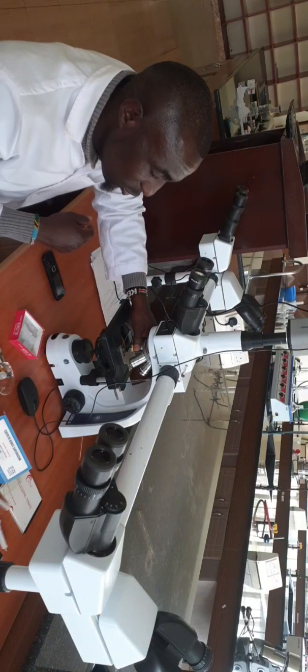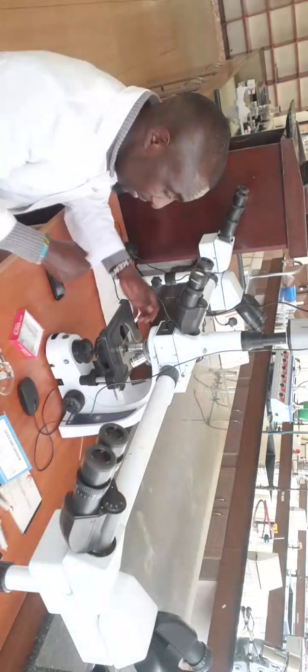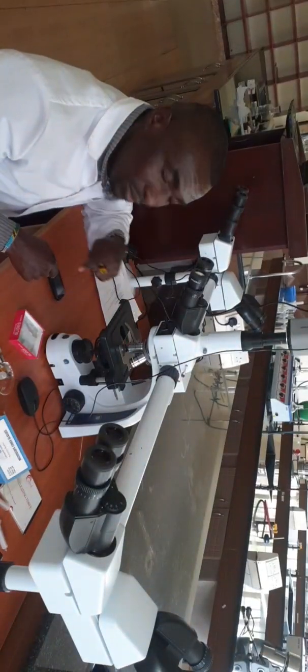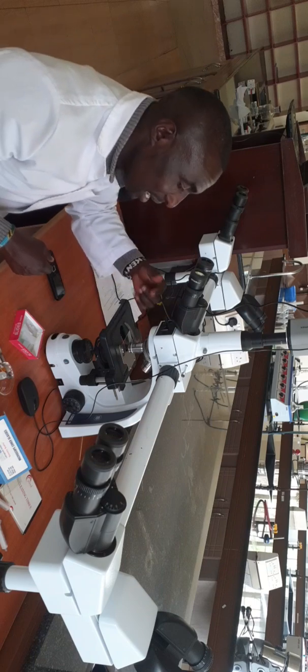The next objective lens is times 40. The times 40 is bluish in color. It is labeled blue. And then the next one is times 100. Times 100 now touches the slide.